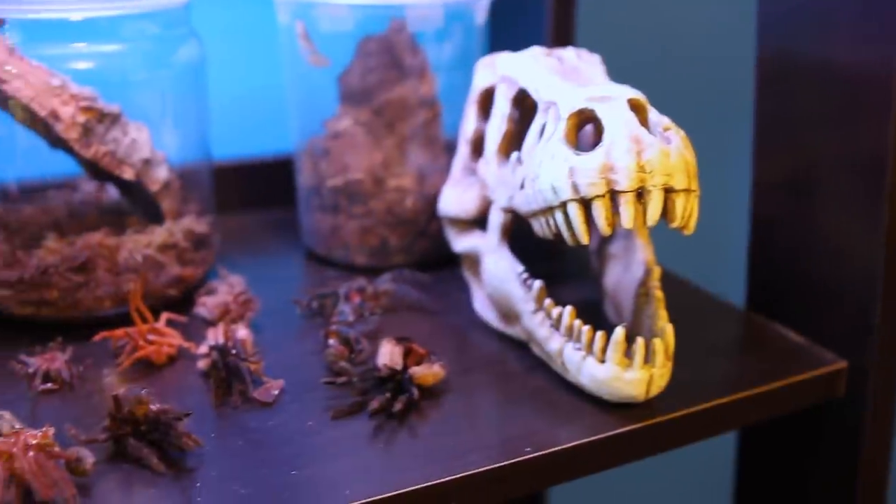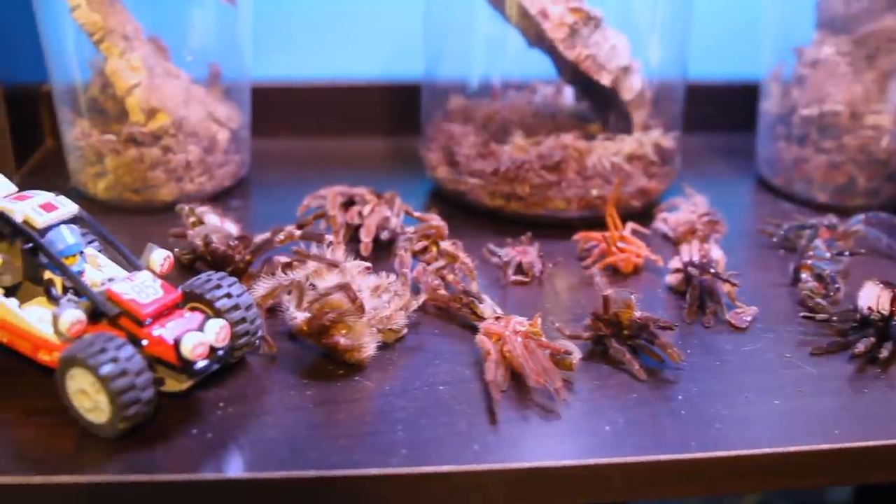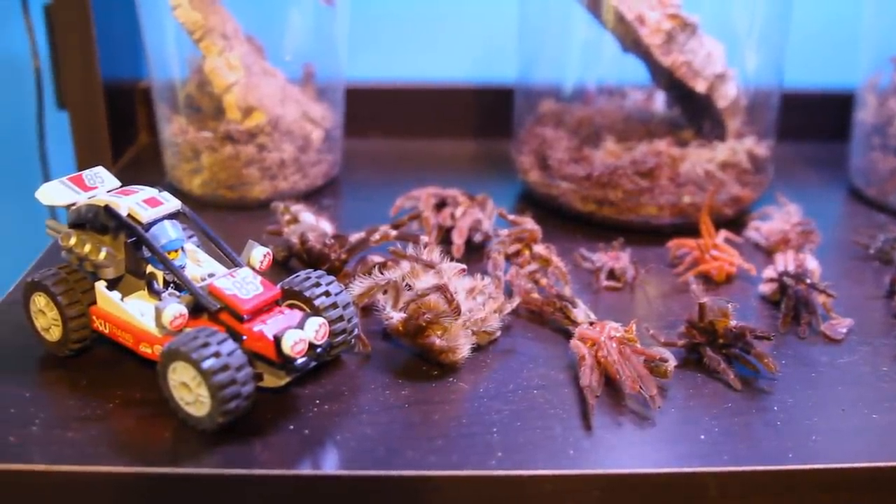So let's turn this into a game. What I have here are several molts I've been holding on to that I want to determine the gender of. I'm going to go through each one and see if I can figure out whether they are male or female. I'll lay out the molt, pause the video, let you determine whether you think it's male or female, and then I'll reveal the answer afterward and see how many you can guess correctly.